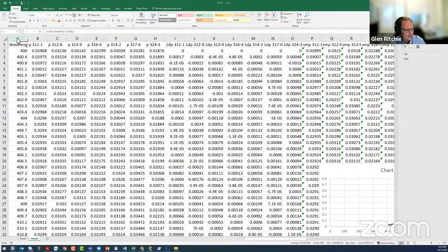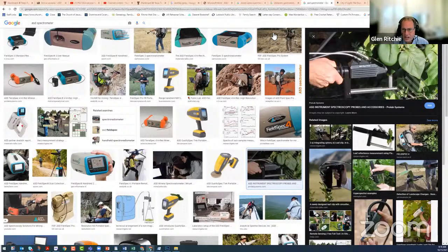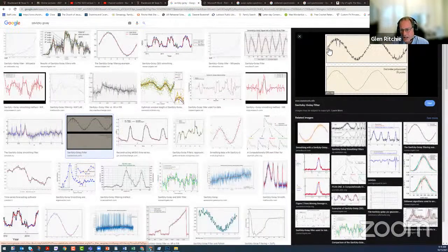There are a lot of different kinds of spectral smoothing. One that I've used for my work, let me hide this again real quick, is the Savitzky-Golay smoothing. And so here's an example. Here's this noisy data here. You run a Savitzky-Golay smoothing, and you can define over what range you want to run the smoothing, and you're able to essentially make this noise disappear. Then when you do your first derivative or second derivative measurements, it keeps everything clean and happy.